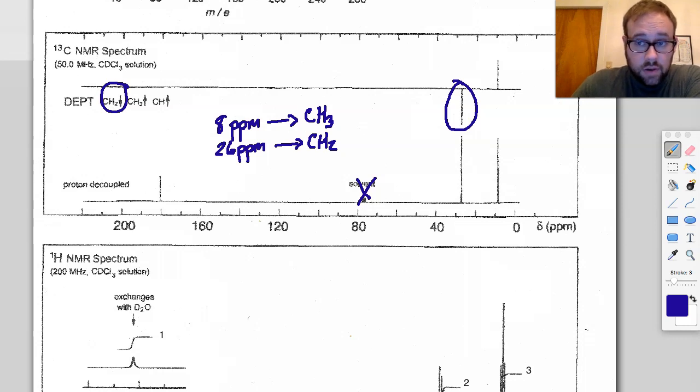This should be our carbonyl because we definitely have a carbonyl based on IR evidence, and sure enough, anything north of about 160, 165 is going to be carbonyl. A carboxylic acid is going to hang out right around 180, 185, and sure enough this looks like it's just a hair over 180, so maybe we'll call that 181 ppm, pretty far downfield. This is confirmation of a carbonyl group, most likely a carboxylic acid.